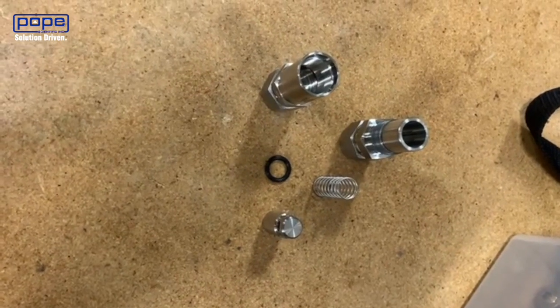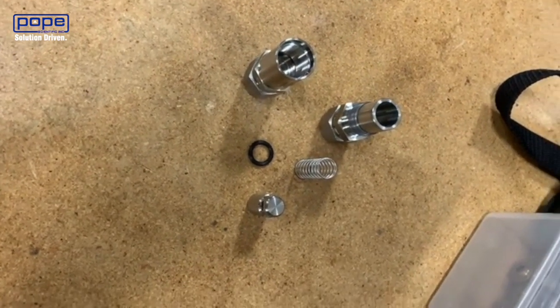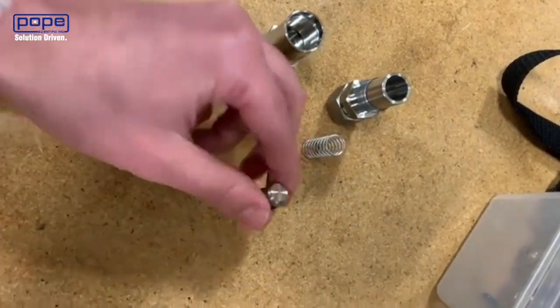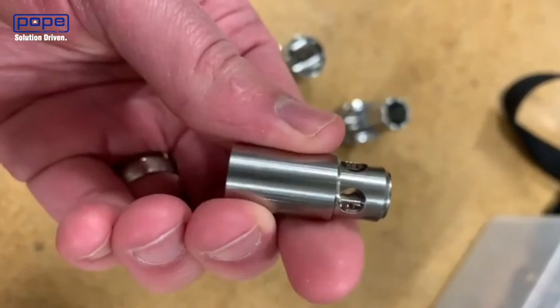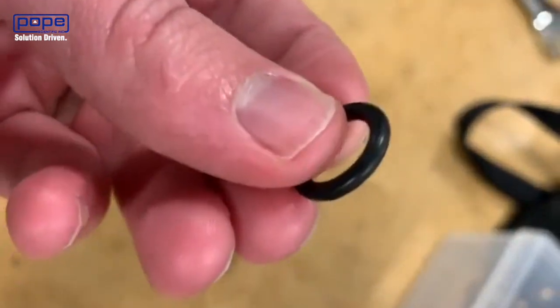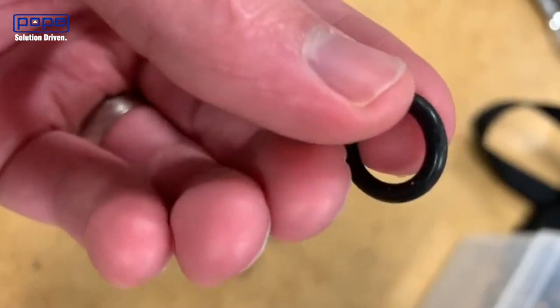Now we've got our inline check valve apart. You're going to clean it with the required solvent that you use for cleaning. You're also going to want to inspect the components, such as the actual poppet and the o-ring, for any damage. The o-ring especially — you're going to want to look for any cuts or nicks.